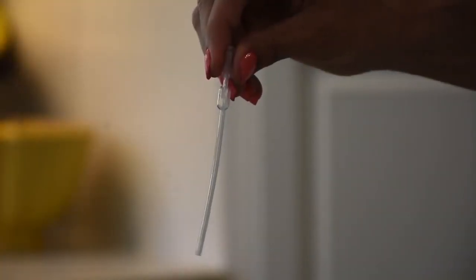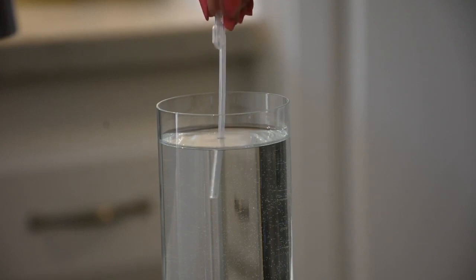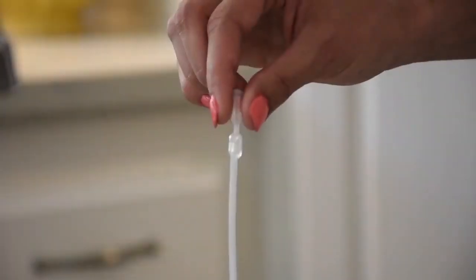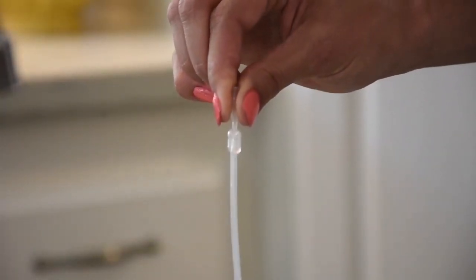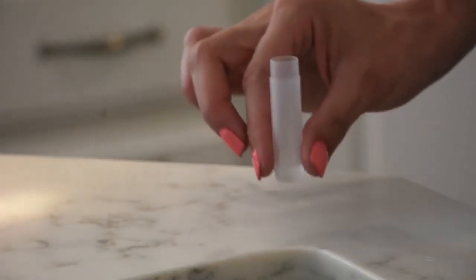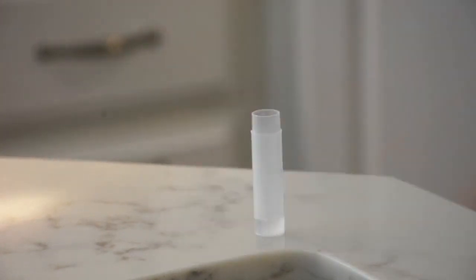To use the pipette, squeeze the top bulb tightly. Insert the pipette into the water sample, release the bulb, and lift the dropper from the water sample. To release water from the pipette, hold the pipette over the vial and squeeze the top bulb. This will need to be done twice to complete the lead and pesticide test. Swirl the vial gently for a few seconds before placing it back down on a flat surface.